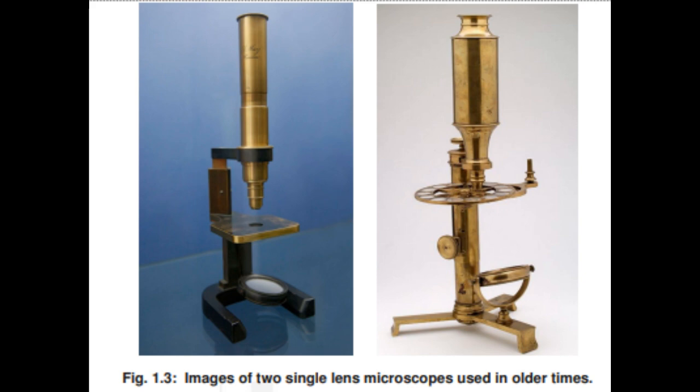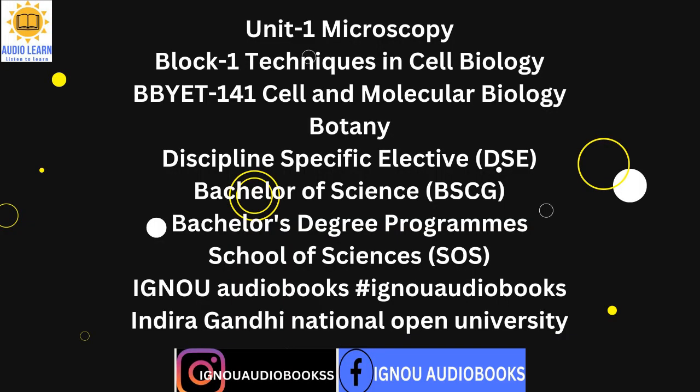Magnification gives a measure of how much bigger an object appears under the microscope. In other words, it is the number of times the object is enlarged when observed under the microscope. You should know that a light microscope generally magnifies the object about 400 times the actual size. Magnification of the object depends upon the ocular lens and the objective lens.